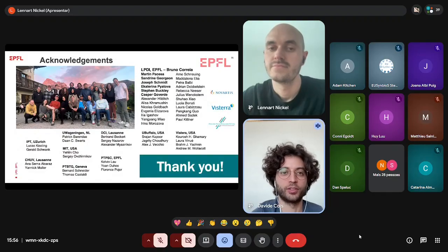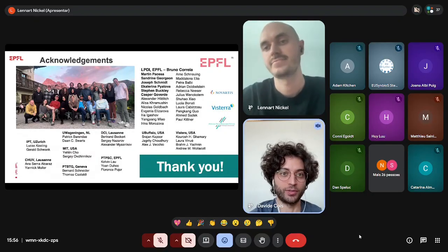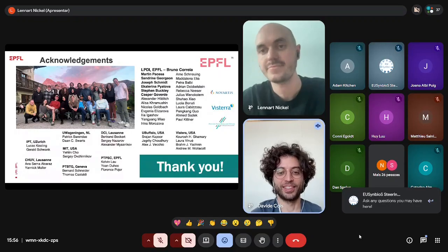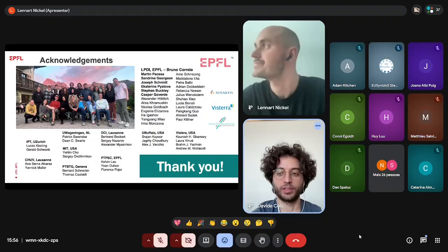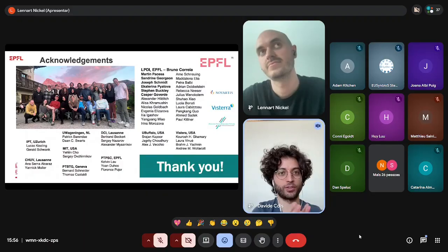In the meantime, while the audience comes up with questions, I can start maybe. First of all, it's really impressive that there is a tool that allows almost anybody, of course, who needs some computing power, but still, to design de novo proteins. And about the novelty of the proteins, I wanted to ask you how far can BindCraft go from the protein structures where it was trained, and at which steps do you think there is the bigger bottleneck in how far you can go, in the first generation, in the evaluation?